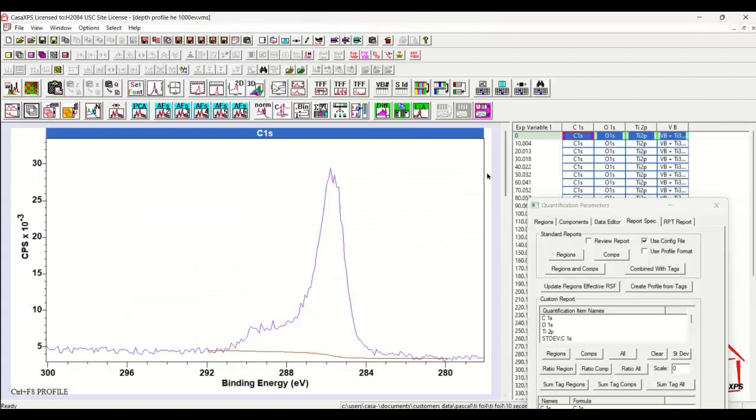When I close that table, I now have a Control plus F8 profile that we see here in the bottom left-hand corner of the display of the spectra. That indicates that this VAMAS file now has a profile associated with it, which I can view using this button that says Cycle File Index. This will cycle between the spectroscopic form of this profile and the depth profile or traces that are plotted as a function of the experimental variable.